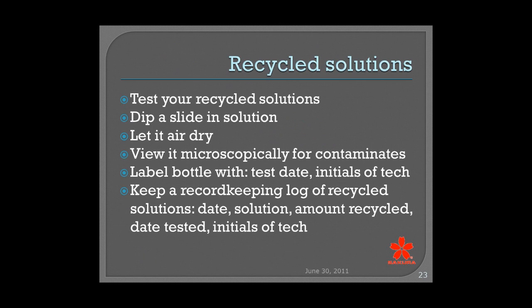Recycled solutions. If you're recycling your solutions, your alcohol specifically, I have the gravity recyclers, and they have a filter pack inside of them. If you have any amount of xylene that has gone into your alcohol recycler, then that filter pack starts to break down. So I test all of my recycled solutions.